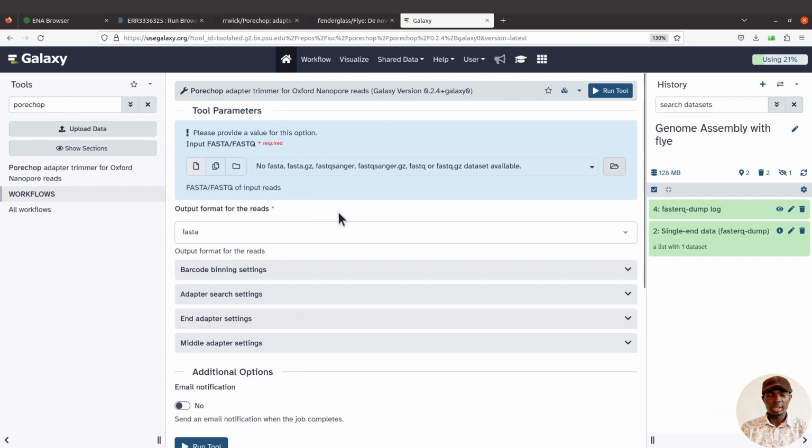All right, so here, because we are dealing with a dataset collection, you have to come to this side here. This one here, dataset collection. This is single dataset. This is multiple dataset. This is a dataset collection. That's what we are going to do because that is how the data has been structured.